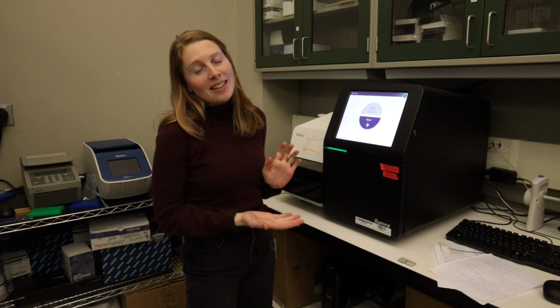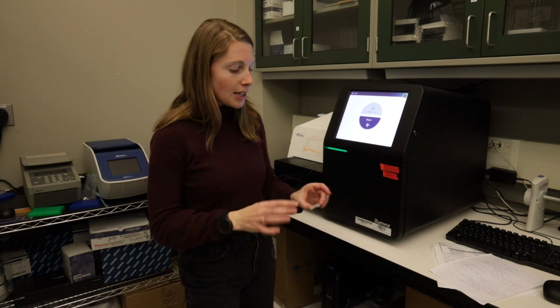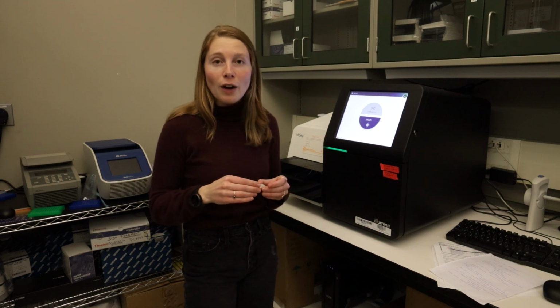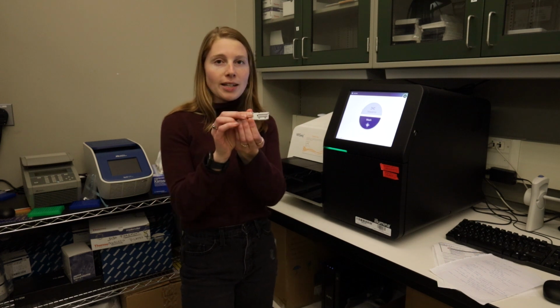So another really neat thing about the Illumina MiSeq is that sequencing reactions can happen at the same time. So you can have millions of reactions happening at the same time. And so the process of Illumina sequencing is you take your DNA and you break it up into fragments, and then you load it onto a flow cell. So this is a flow cell.